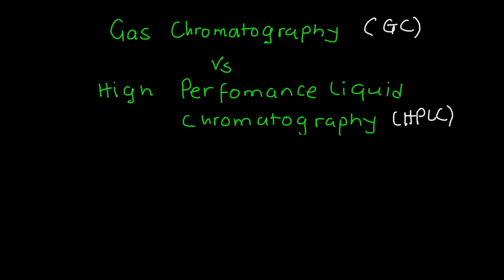Hello guys, welcome. In this video, I'm going to take you through the differences between gas chromatography, which is GC, and high performance liquid chromatography, which is HPLC. I'm going to go through a number of points, and then I'm going to explain those points as we go further.